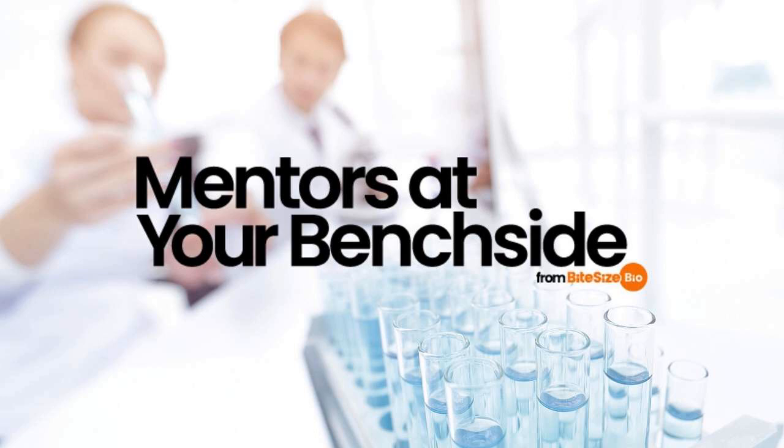Well, while the Maxam Gilbert method is not used as much as it once was, it is still used in some specialised applications where aspects of the process, namely the chemical cleavage step, make it useful. DNA footprinting. DNA footprinting enables the identification of sequences of DNA involved in protein-DNA interactions, and Maxam Gilbert sequencing can be used to do the sequencing step.